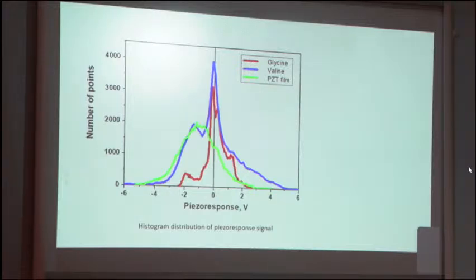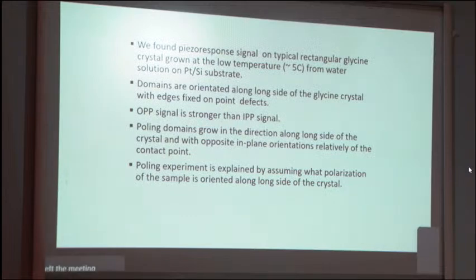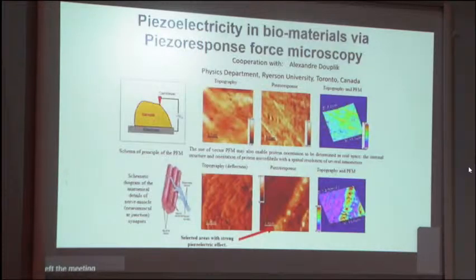If we scan a big size, there is more statistics, but less resolution. But it is possible to estimate, using standard software, and determine the piezoelectric coefficient in the material. But the error is relatively big, 10-20%.